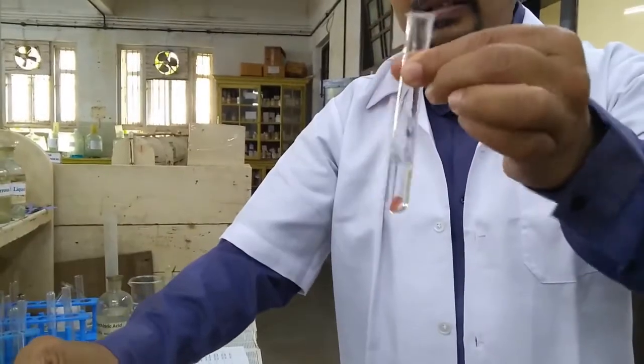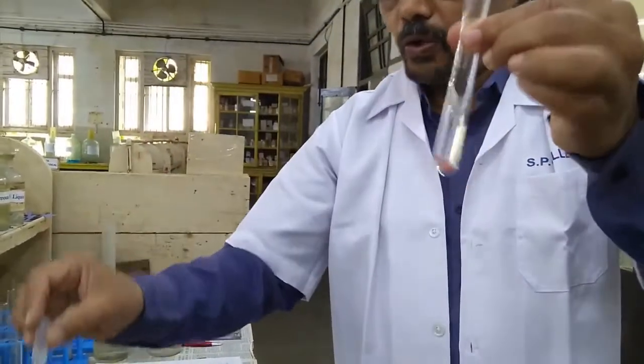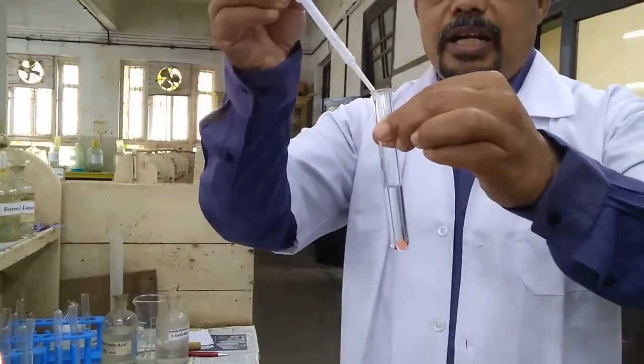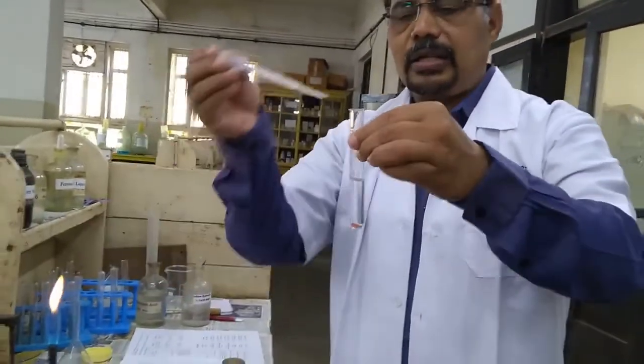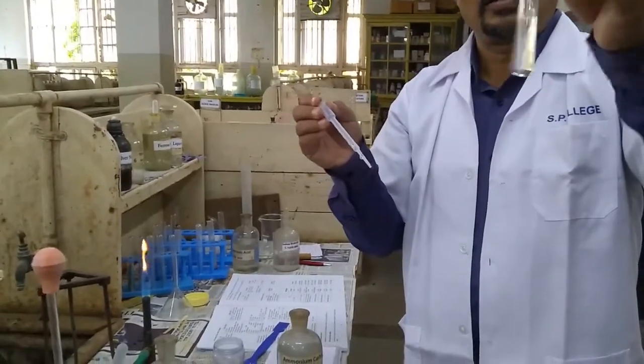So I will add this NH4Cl solution, NH4OH, till the color of the red litmus paper becomes blue. Then that solution is called an alkaline solution. I will mix it well.